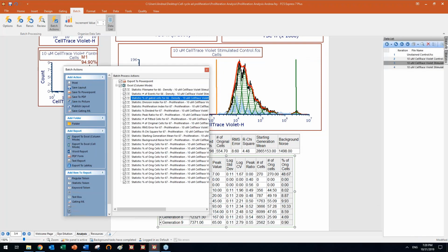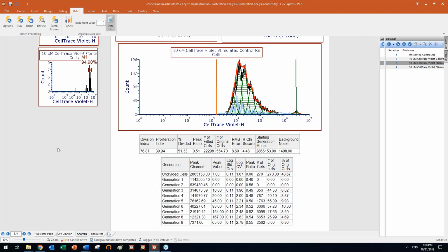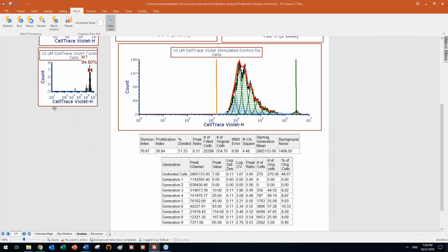And the amount of rows will match the amount of iterations that you're going to export. So if you want to export all those iterations, just start from the first one. In this case, I'm just interested, for example, in the last two on my sample. So I will just export number 3 and 4. So we'll start with number 3. I want to show you a few options.